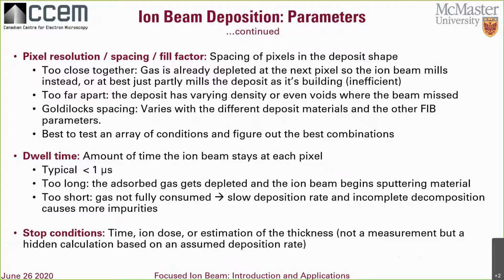As for dwell time, fast is probably better, but with some microscopes, there's sort of an inefficiency in when it switches positions, so you may actually get more net deposition by slowing it down a little bit.